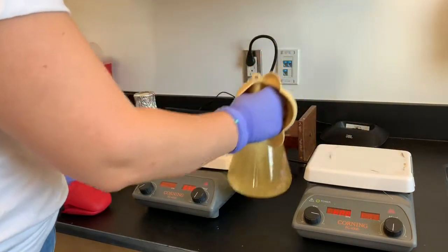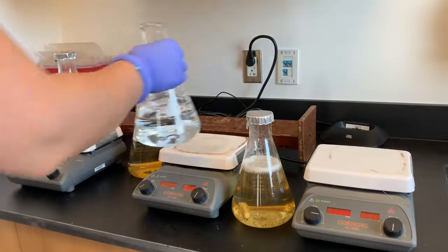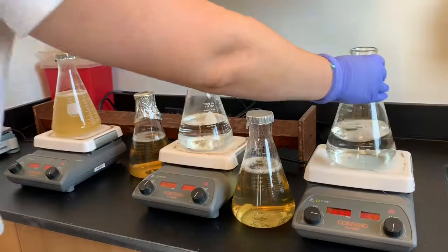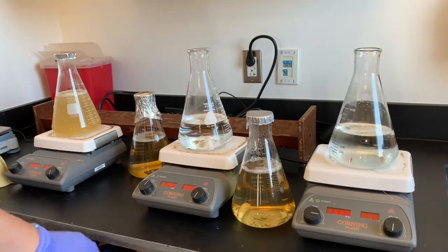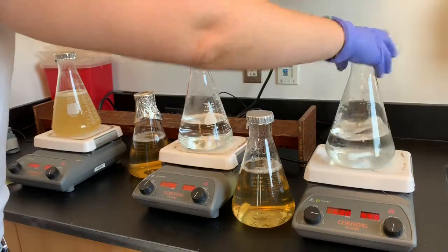That's boiling. In the meantime, I'm going to start my other one — because the slower the stirring, I need to get these warmed up. Then I'm going to take the lid off. I'm going to start my other one. So let's keep it going — I've got my other two flasks.